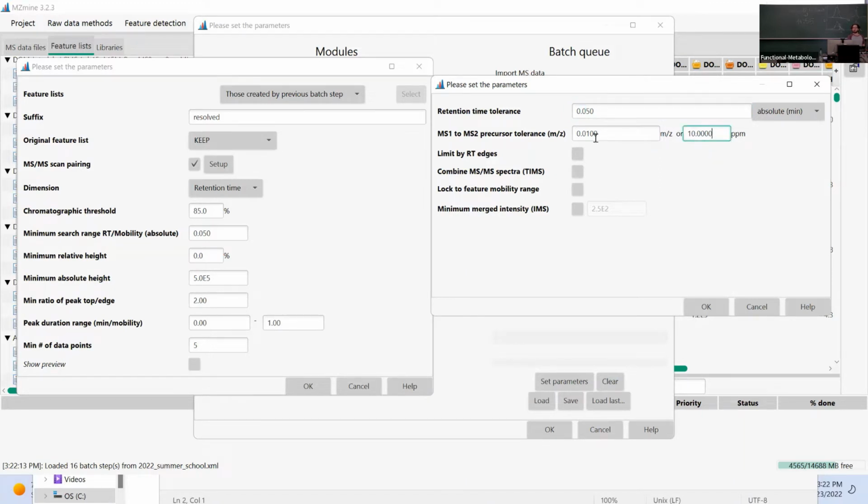And we also use a relatively wide m/z window. But if you consider that your quadrupole that is selecting the ions also has a pretty wide window, you're definitely going to have signals in there in the MS2 spectrum if something with like 10 ppm was detected at the same time, or like 0.01. So the quadrupole usually has a unit resolution, a bit better if you have a good quadrupole in your instrument.